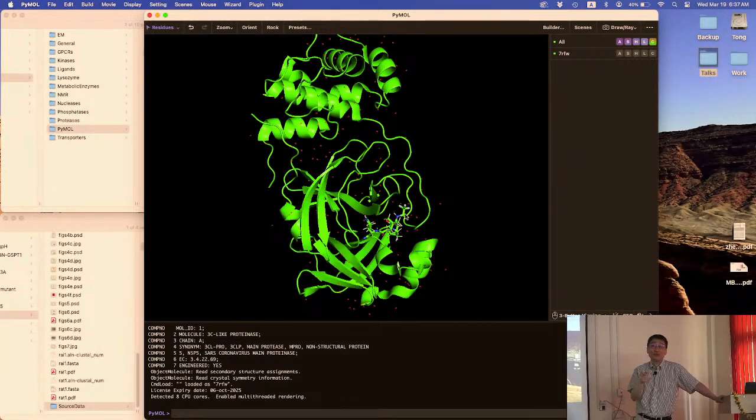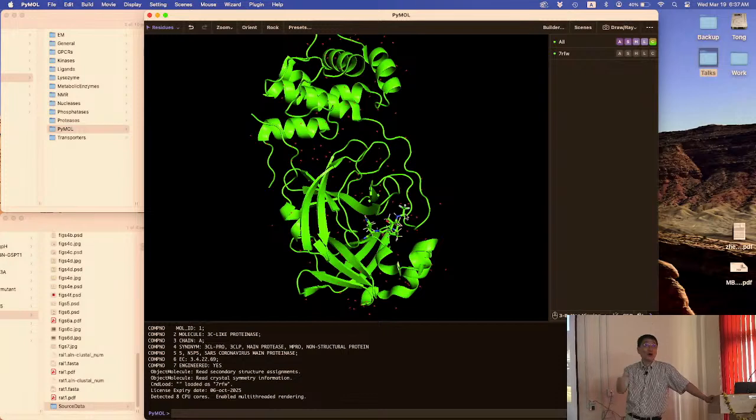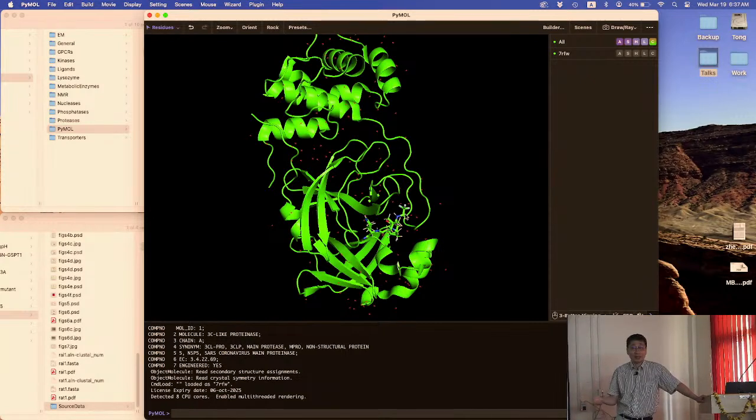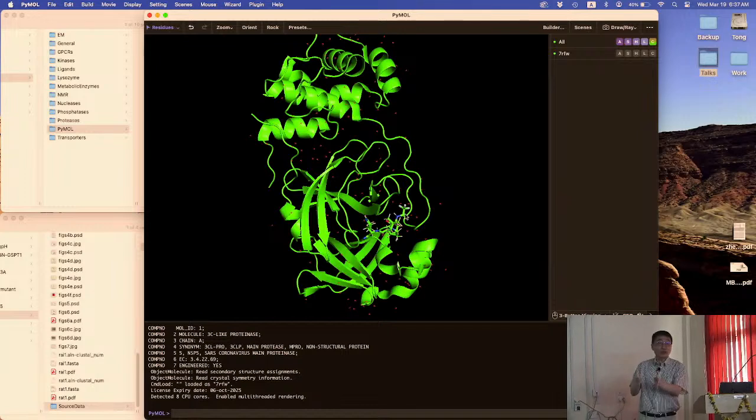Just like Coot, we'll start PyMol today, and then you go home to exercise PyMol, and then tomorrow we'll try again. And then I'll figure out something to show the structures I talked about today. That's okay. I think it's more important for you to learn the tools so you can look at the structure yourself. If you don't know the tools, you can't look at the structure yourself. So it's more important for you to learn the tools first, right? Do you all agree with that?